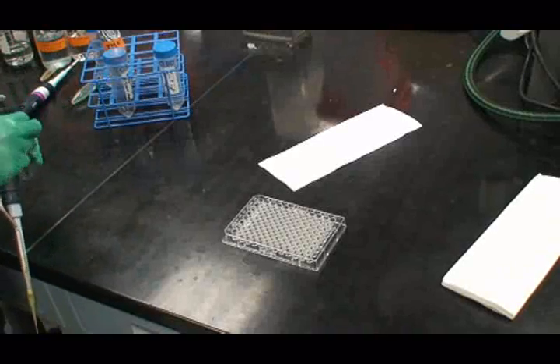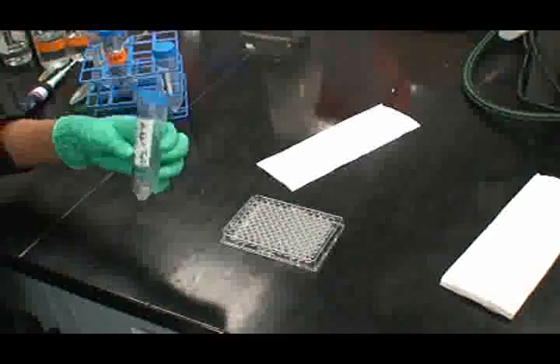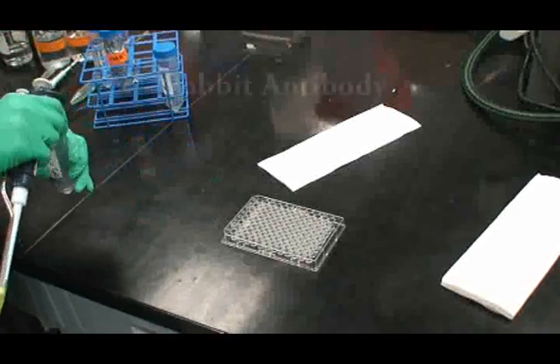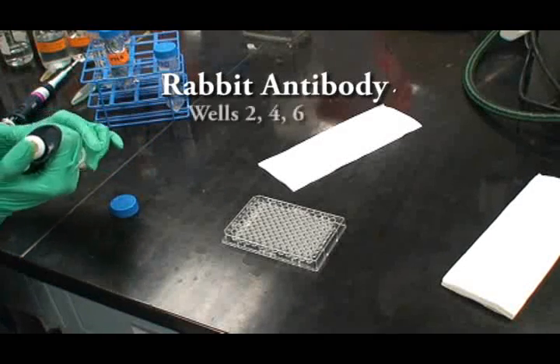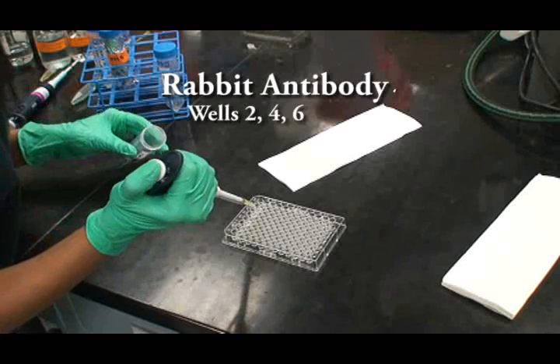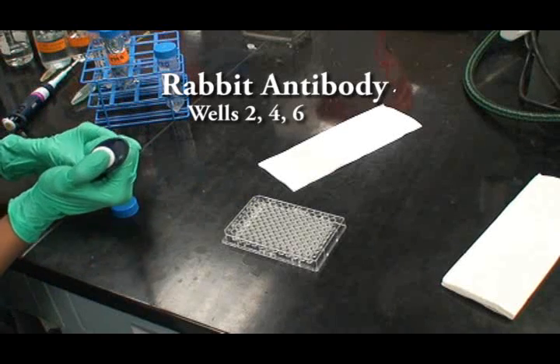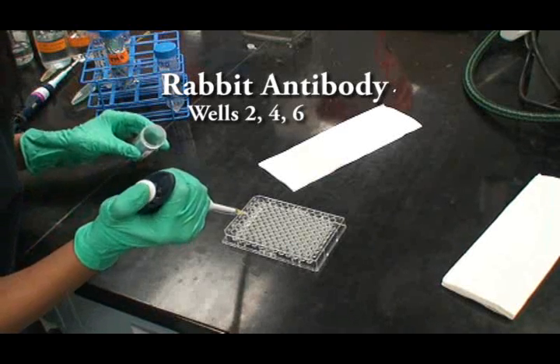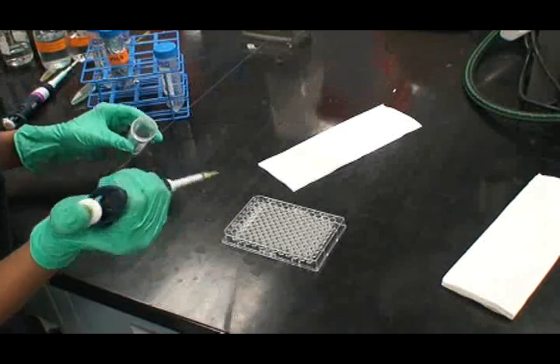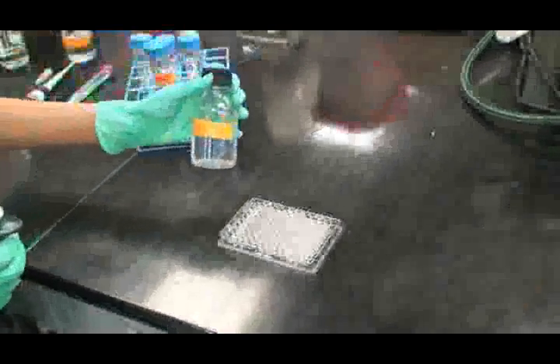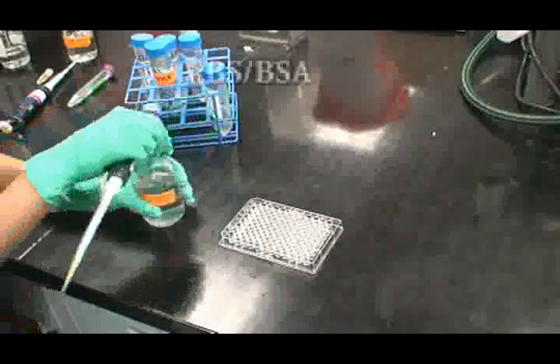Add 100 microliters of diluted rabbit antibodies to wells 2, 4, and 6 of each plate. Add 100 microliters of PBS-BSA to wells 1, 7, and 8.